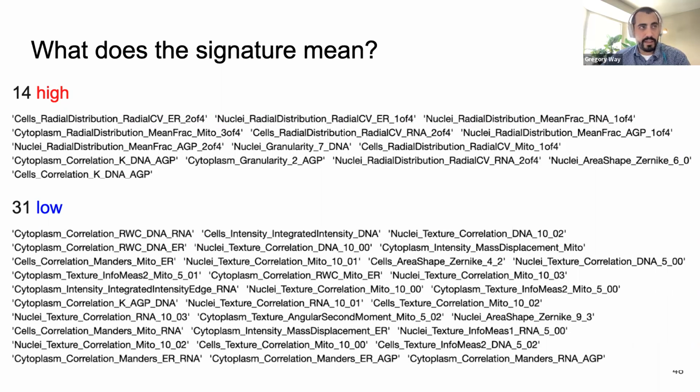I mean, that's a good point. There are some common responses where, no matter what the drug is, at a high enough concentration the cells are going to shrink, or lose adhesion to the plate. That could be a pretty interesting project, in which you try to identify a signature of that, and then anytime those combinations of features light up, that's telling you that this common response is occurring. So that would be cool.